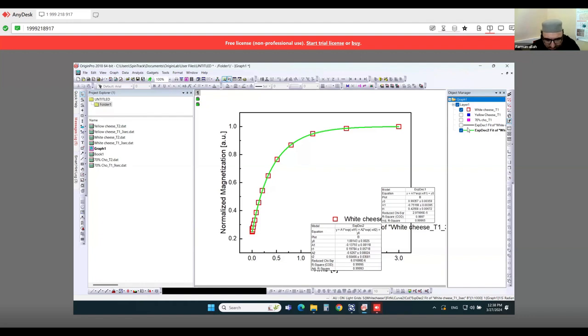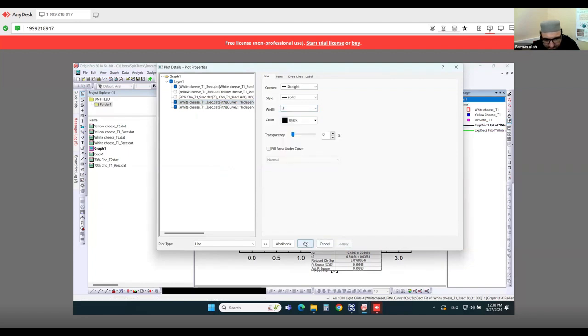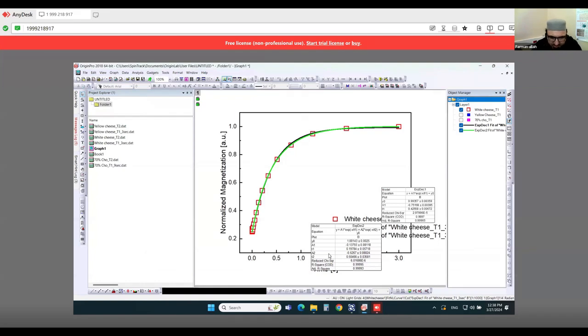So you see, now both seem to be fitting well. This is also a question from you people from the last two days of discussion. What do you see, which one is good, which one is accurate, from your naked eyes? Then we will go to the next step. So what's yours? Same? They're the same. They are the same.